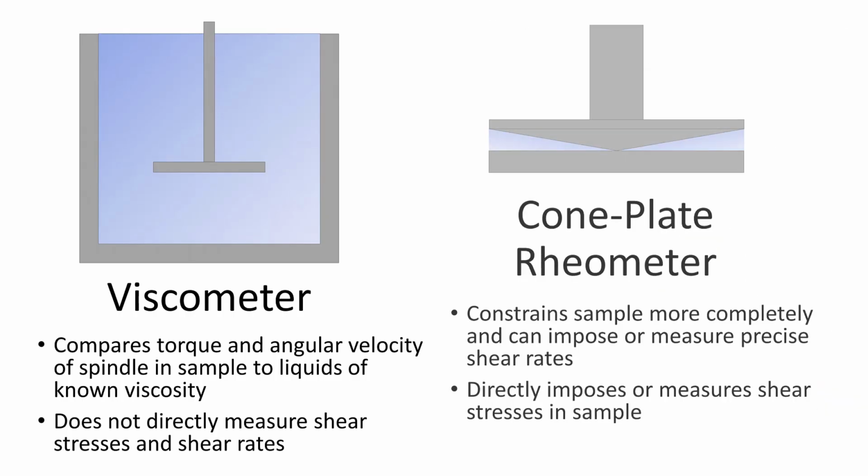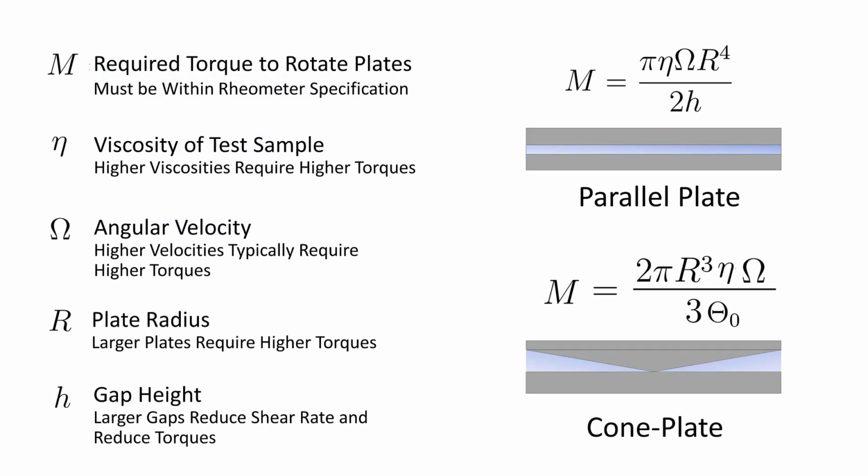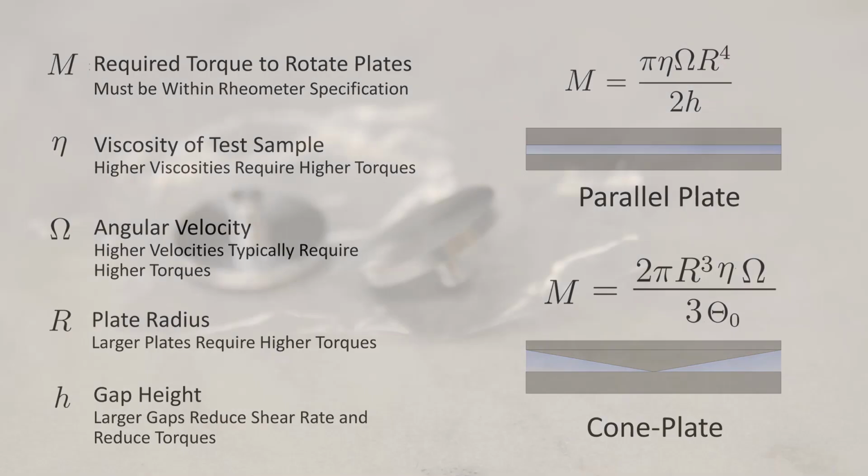We will use a rheometer to more closely control shear rate, which may or may not be necessary depending on the application. With the rheometer, we can use the measured torques required to deform a sample at a measured strain rate to calculate viscosity. The measurement system geometry is also required, and using these equations we can determine the viscosity of our sample.